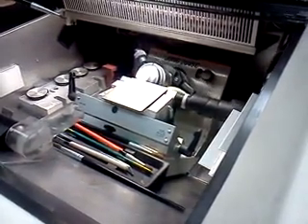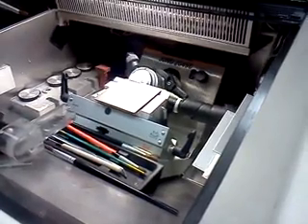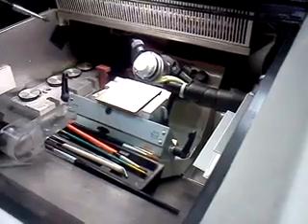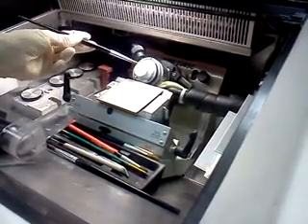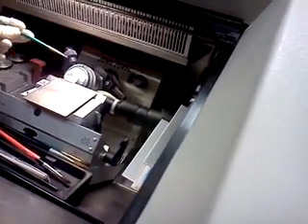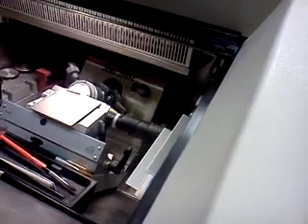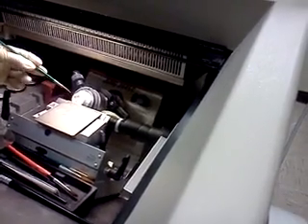This is at 100? All right, I'm going to start collecting, even though this part up here I'm probably not getting. So this is where the work comes in. Now, you take these brushes, and as you come down, you grab this piece. Oh, I didn't take it off of 100. That would be important. Okay, now. We're going to throw away the first one because it's going to have to get used to the idea it's now cutting at 10. Second one ought to be good.